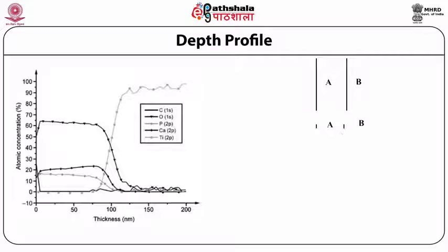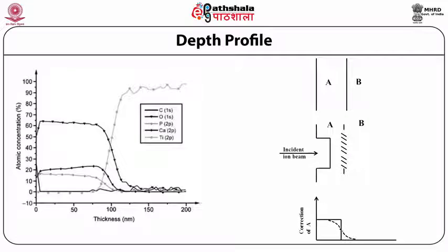In samples comprising several elements which are not uniformly distributed, certain areas are etched faster than other areas because of preferential etching. This results in a rough crater surface generated with increasing depth of etching.